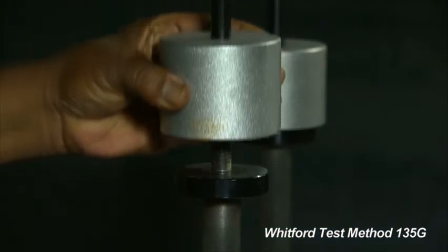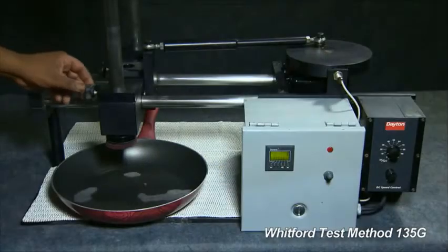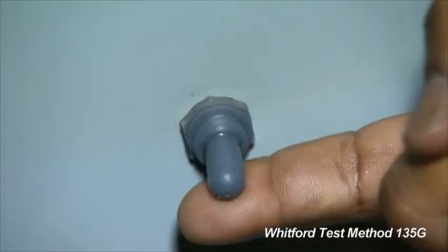Whitford uses a 3 kilo weight to shorten the time of the test. Lower the stylus onto the pan. Set the counter to 0 and start the test.